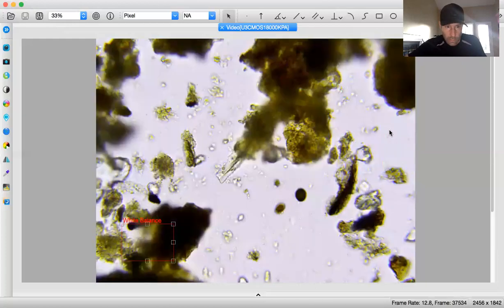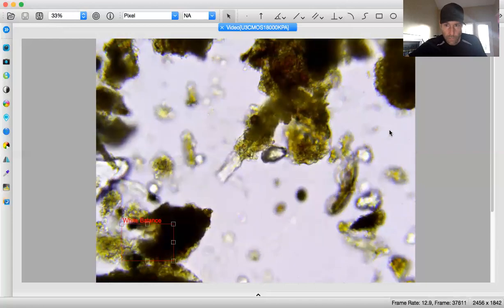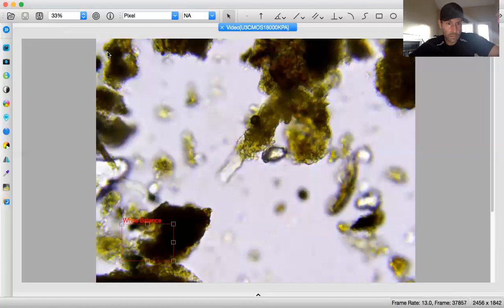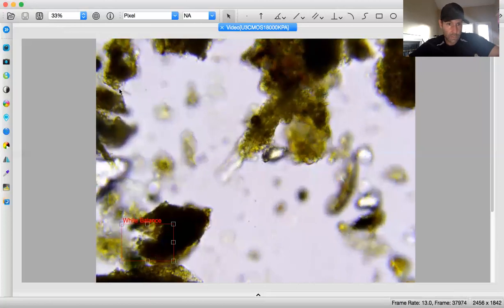Down to 4, reading area 4. Okay, let's see what we got here. Go to the top just in case first. Going down slowly. Not seeing any filaments. Oh, there's a little actino. So what is that? Let's look. Oh, is that a flagellate? There's a flagellate right in there. It is a flagellate. You guys see him? He tried to point with mine. So he was right in there. Now he's up here. Yes, that is 100% a small flagellate.